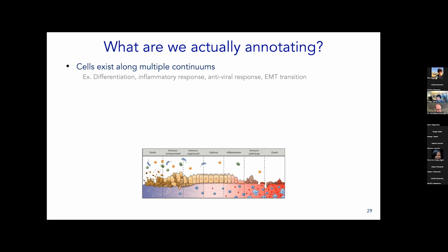Yeah, and if I can add, it's also computationally a lot more expensive to not use PCA. If you try to do a UMAP on all your genes, it will take days, while if you do it on the PCA, it takes a couple of minutes. So it can be very, very expensive computationally. Unless you're working with certain types of single cell omics like CyTOF, where you have maybe 30 or 40 markers, then it might be feasible. But even then, you might be losing some information.